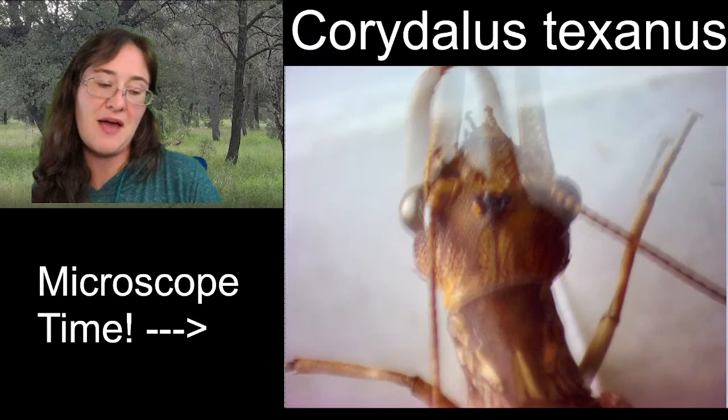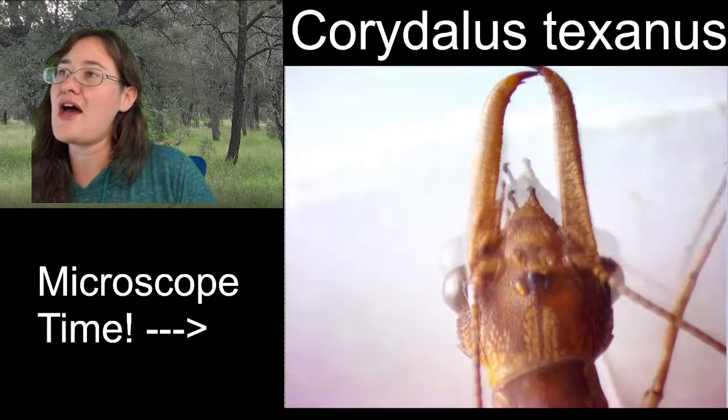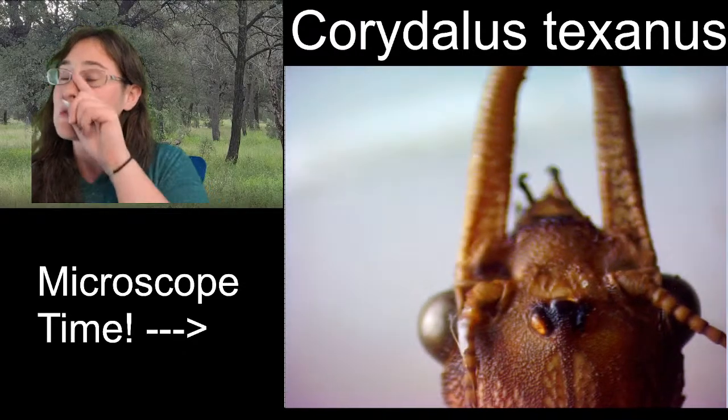We have the compound eyes situated at the base of the head. So we are going to go ahead and look up here at the front region, mostly in front of the head and where these mandibles are starting.